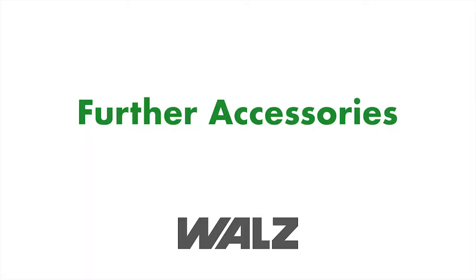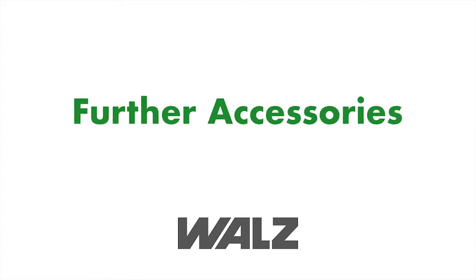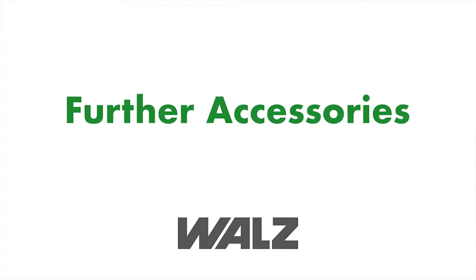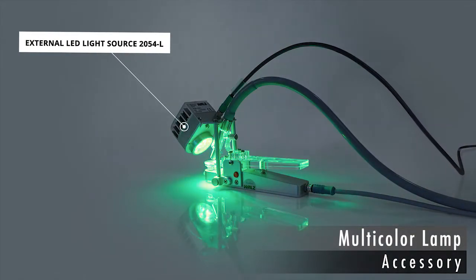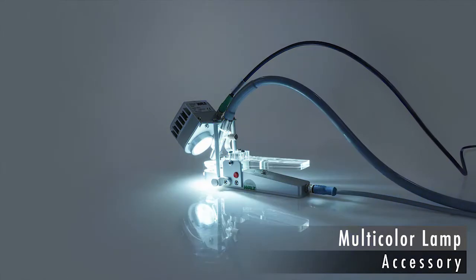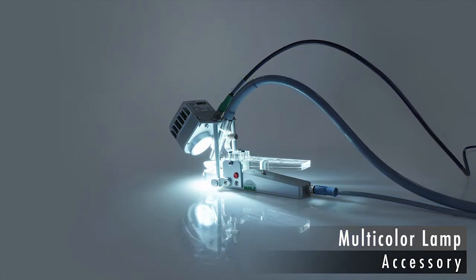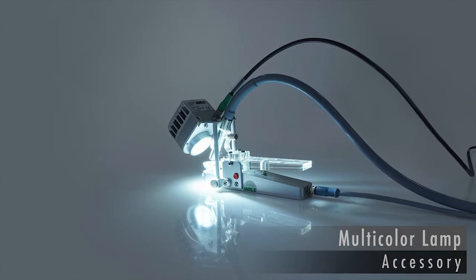The mini-PAM 2 fluorometer can also be upgraded, depending on your experimental needs. A high-intensity lamp emitting red, green, blue and white light allows for a flexible design of the spectral properties of light.